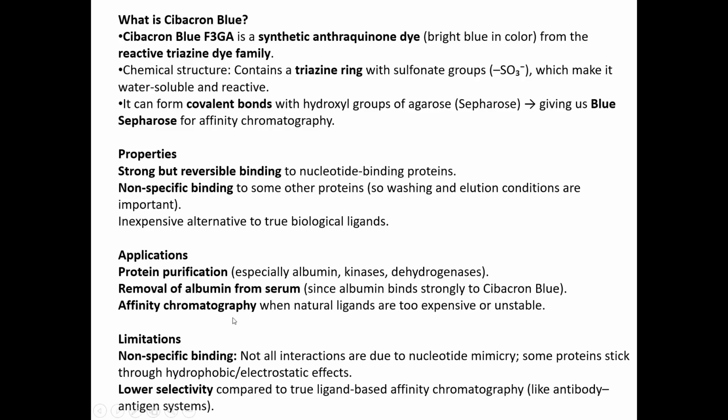Then also there are a couple of limitations. Non-specific binding: not all interactions are due to nucleotide mimicry. Sometimes some proteins stick through hydrophobic and electrostatic interactions because this is also reactive. And sometimes the selectivity is low when compared to true ligand-based affinity chromatography like antibody, antigen, etc.